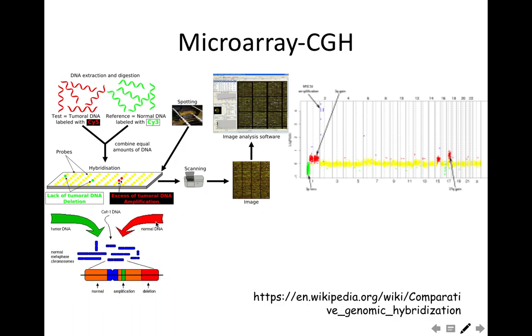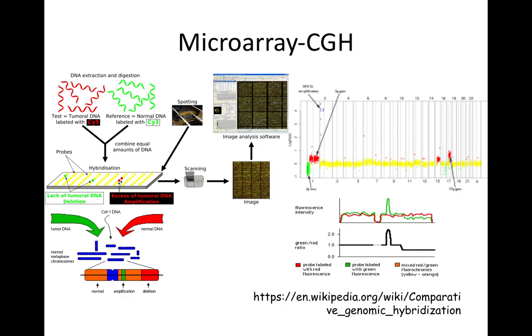Okay, so here is the DNA different. ناخد بالنا هنا هو يعني دي another picture عشان بس ما نبقاش متلخبطين. احنا فوق قلنا ان red is tumor and the green is normal. هنا متلخبطين بس ده ما يفرقش معانا، احنا بس عايزين نقول ان الكونسبت two different DNA, two different genomes، واحد normal as reference وواحد بتاع التيومر. بيحصل لهم hybridization على السلايد اللي فيها probes من different chromosomes. تمام، وبعدين أوزن التو dyes. لما الاقي excess of the tumor DNA يبقى عندي amplification، لما الاقي excess من النورمال DNA يبقى عندي deletion في التيومر. يبقى انا النورمال ده بستخدمه as الريفرنس بالانس بتاعي اللي هقيس عليه التيومر DNA. وبعدين بالايمج اناليسيس هعرف اوزن الاثنين واقول في الجزء ده من الكروموسوم ده عندي deletion او عندي amplification.